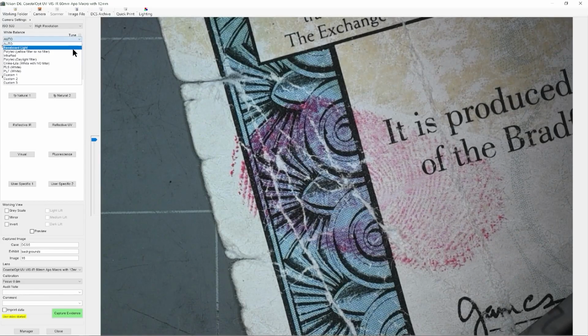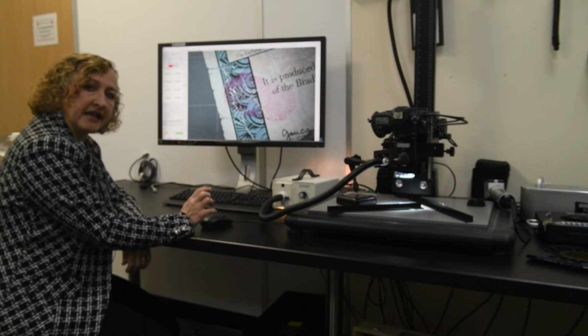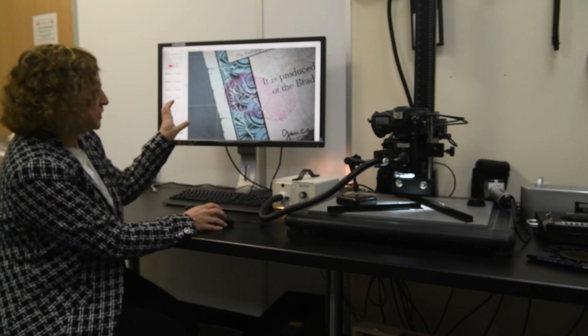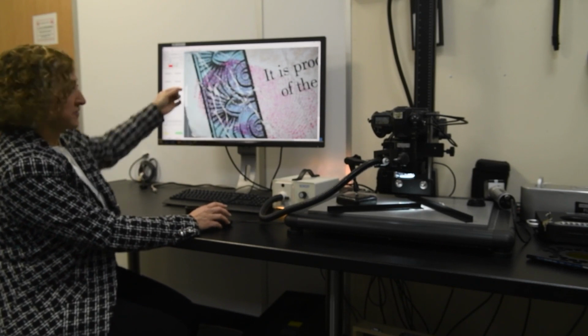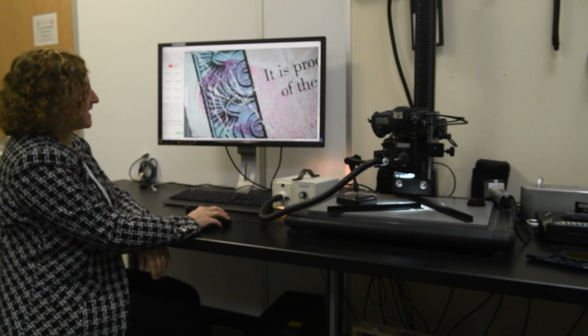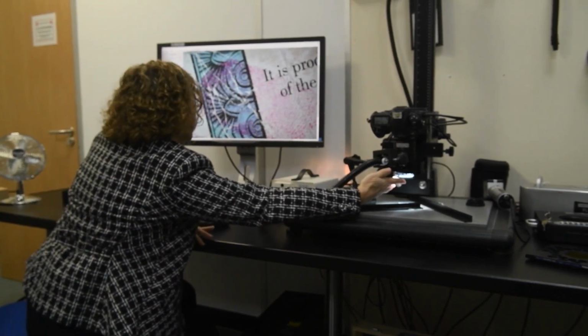We can use the software here to change the white balance, and you can see the white balance is changing drastically to different colors. We need to make sure that we're capturing this with the correct white balance. Otherwise, we'll get incorrect information in the Bayer filtering pattern. Again, this is also illuminated using polarizing filters. And to accurately capture these black strips running through the image, I'm going to very carefully adjust my polarizers, so instead of seeing a black stripe, we need to see a shade of grey.